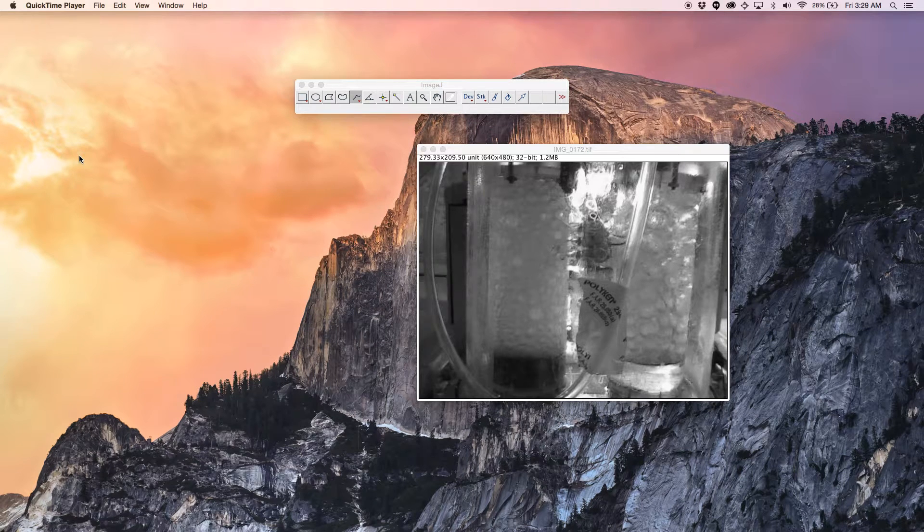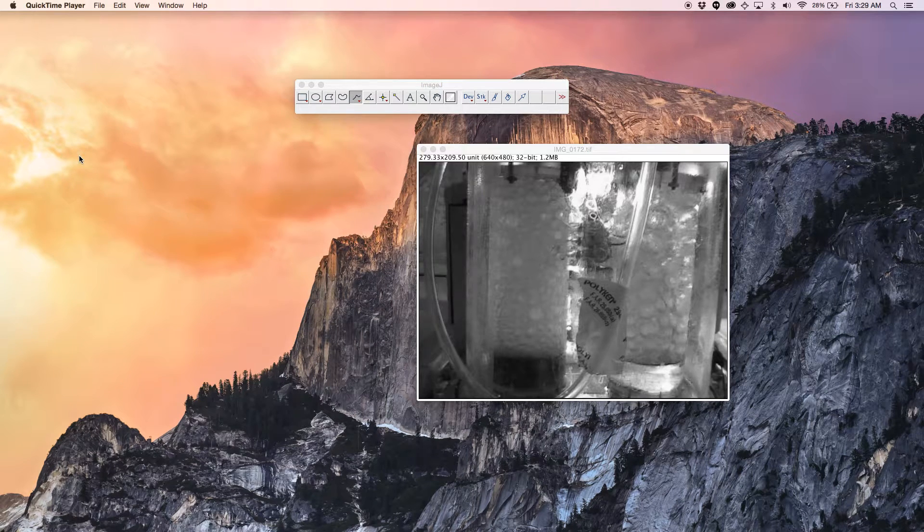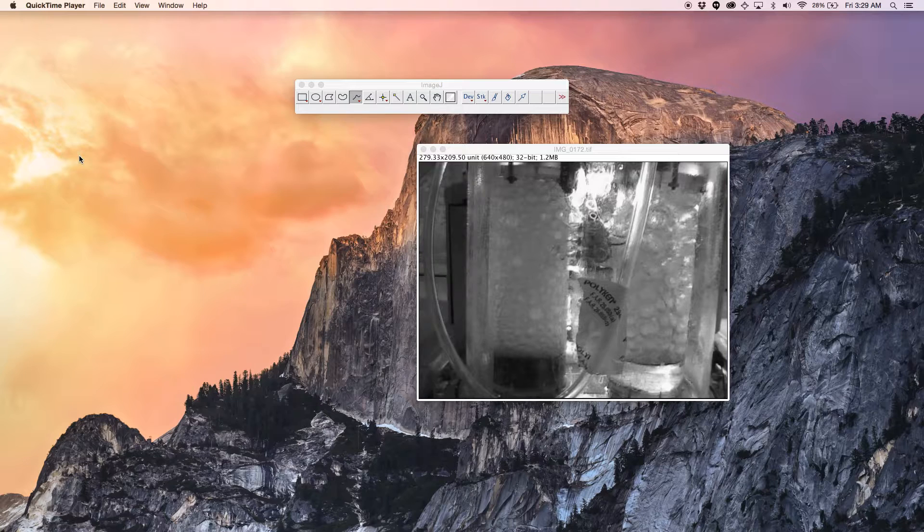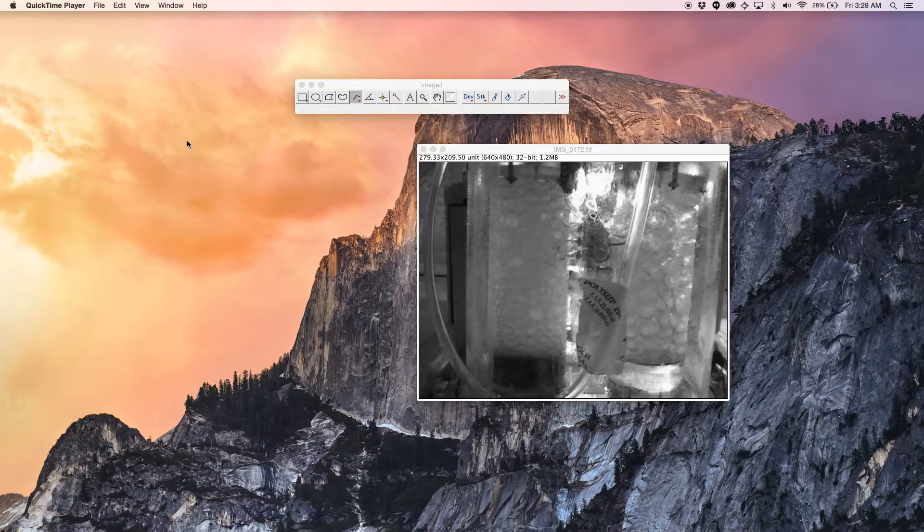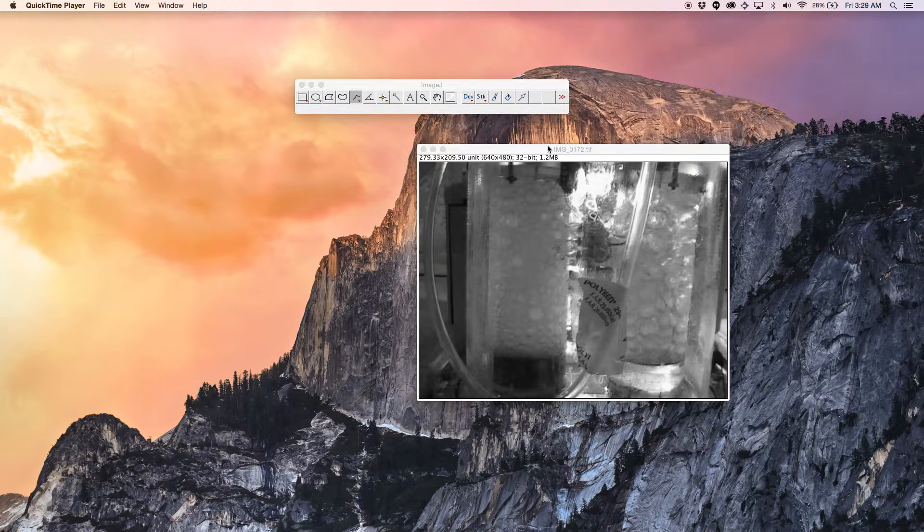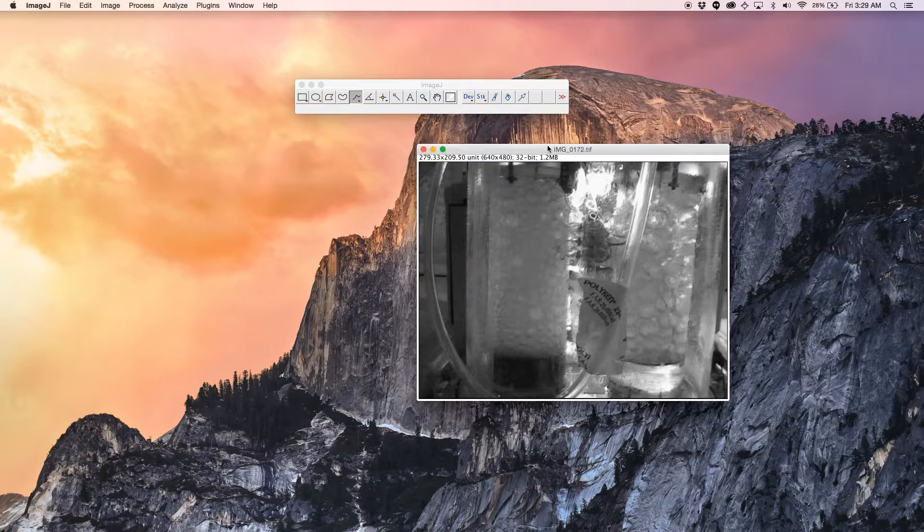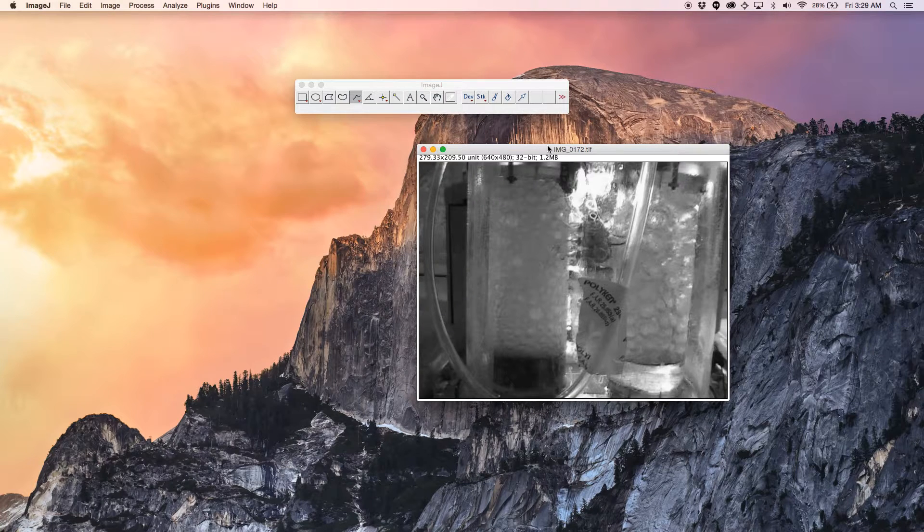This video demonstrates how to use the background noise subtraction on ImageJ. I have opened my image here.